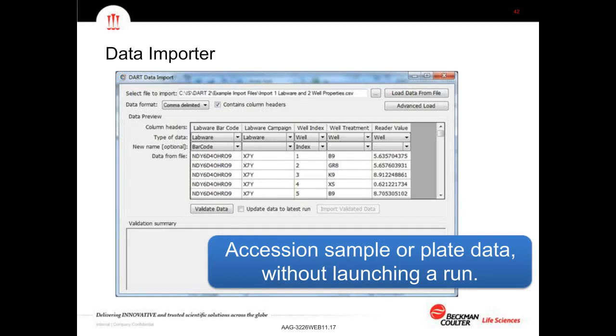So this is how we'll look at sample identification. The next step is that once you have sample IDs established in the system, if you're bringing this onto a liquid handler, you're going to be doing pipetting. And so in that case, we need to have sample traceability. And this traceability will be watching how we move through the system.